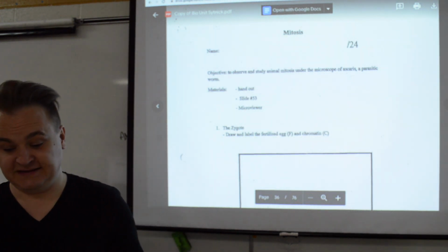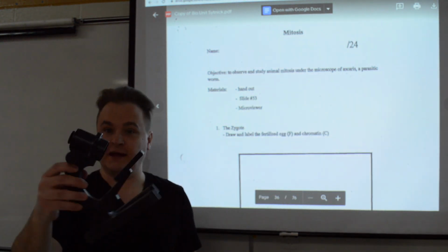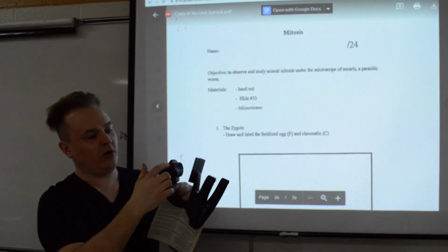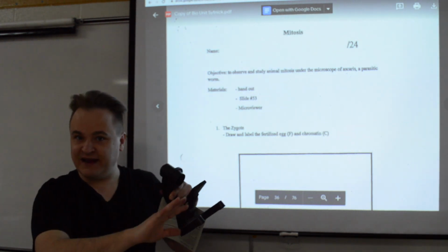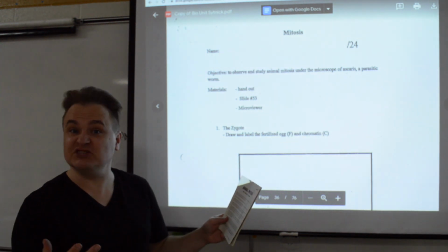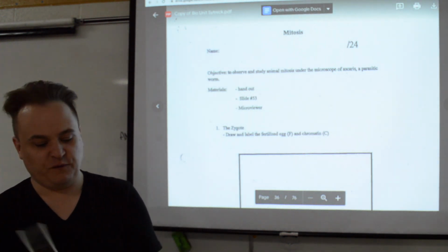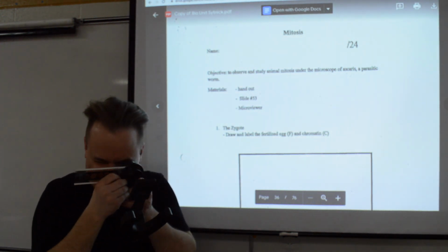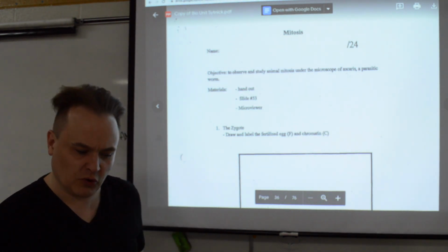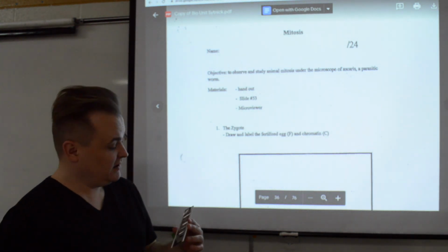What a microviewer is. So you probably have never heard of a microviewer. A microviewer is this thing. It's like a microscope, but you put your slides through a little slide hole. It has a nice white backdrop to make it nice and clear. And you would put your slides, so you would open your booklet, which you can't have, but I've made digitally for you. You would open your booklet, you'd take out your slides, you'd feed them in, and you would look at each slide. And I believe this is a worm cell we're looking at today, yes. A parasitic worm, an ascaris.